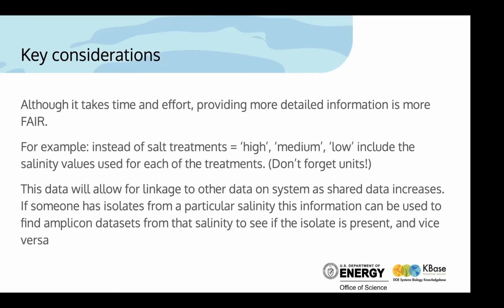And so this can help you to engage with them and say, okay, I see these really big differences in your data, and we have data sets that aren't exactly the same, but we can do something together. Is it possible for us to ask questions that are at the interface between what we have?